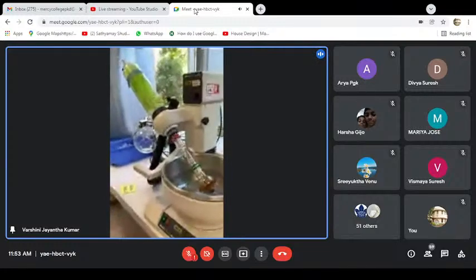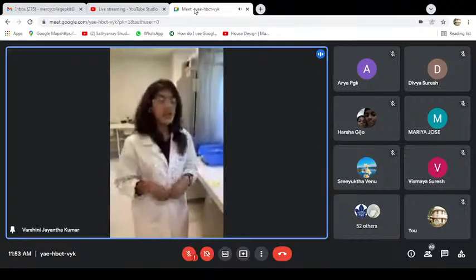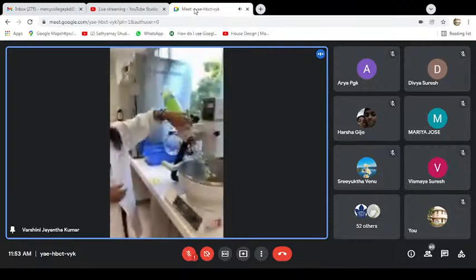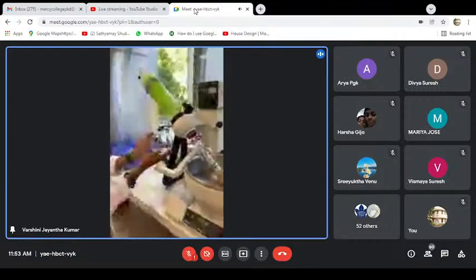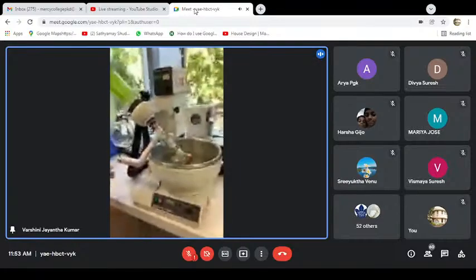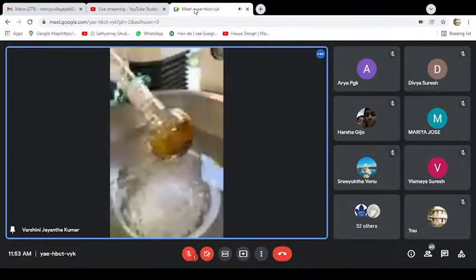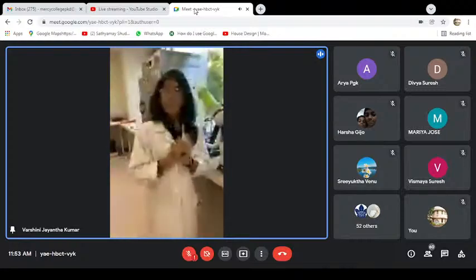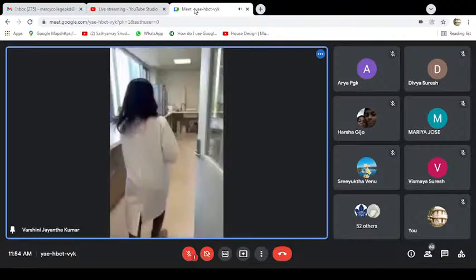But when I reduce the pressure, I can evaporate hexane even at a temperature of like 25 degrees Celsius or 30 degrees Celsius. So all the hexane will evaporate and go here, and this coolant will condense back the hexane and it gets collected here, leaving a solid final product inside the round bottom, like here. So this is dry now, which means all the solvents have been evaporated. So that's about the rotary evaporator. Now I can show you my working space.